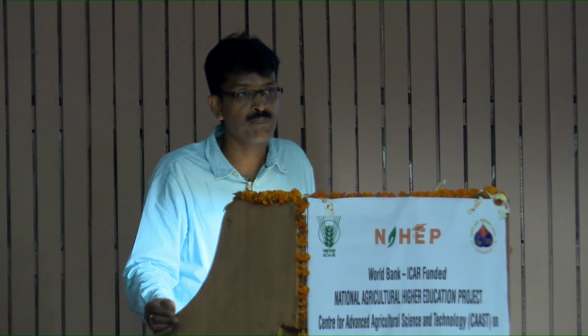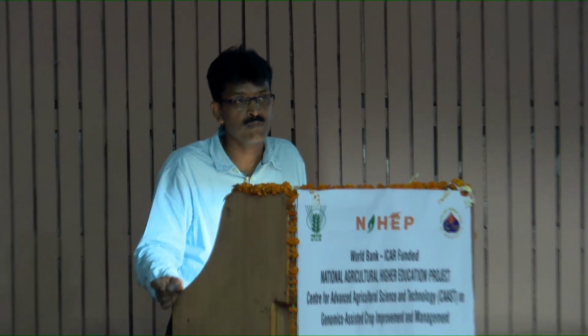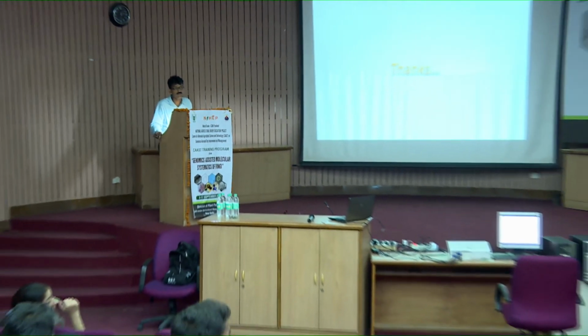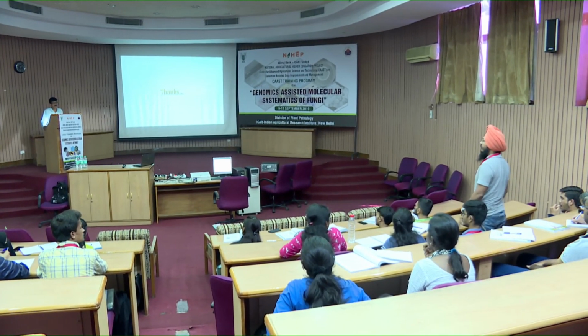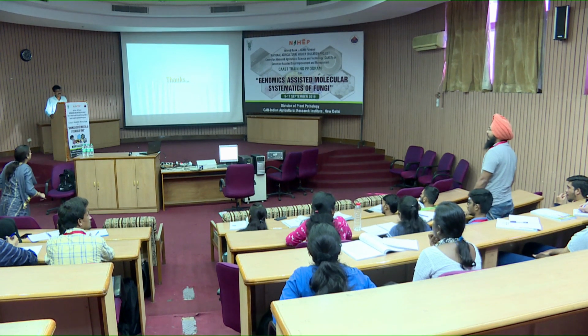Yes, please. When you told about the RT-PCR, you said that we can remove the other RNA and retain only mRNA. Is it necessary to remove the other RNA? If yes, what is the methodology we can use to remove the rRNA or tRNA?